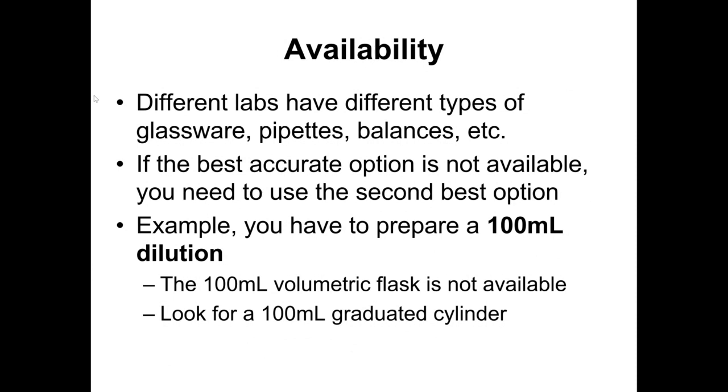Some labs may have more materials than others, so you have to work within the limitations of the lab, in terms of the glassware, pipettes, and balances available there. If you can't get the best theoretical option, then you look for the second best one.